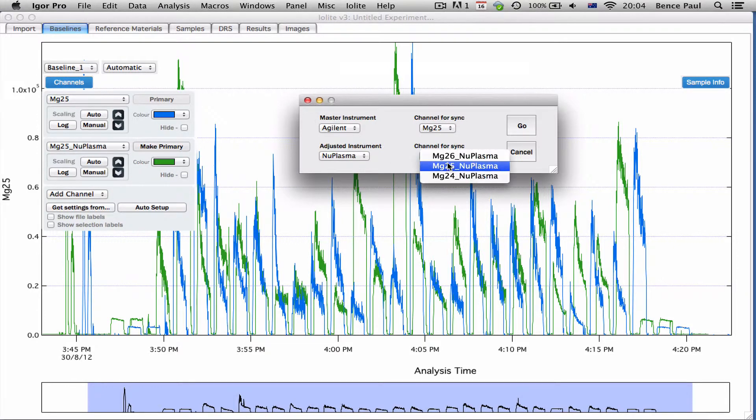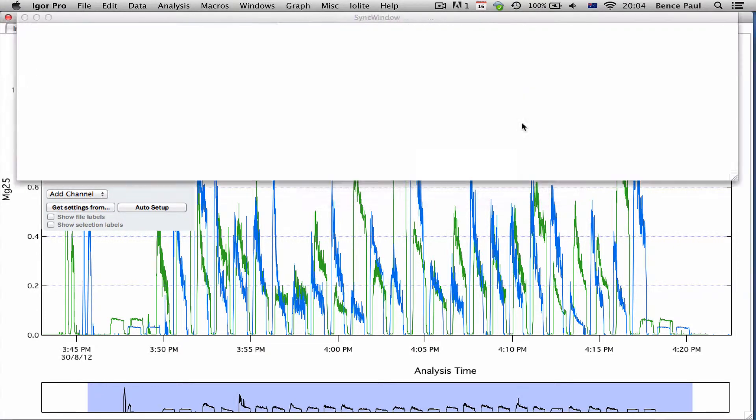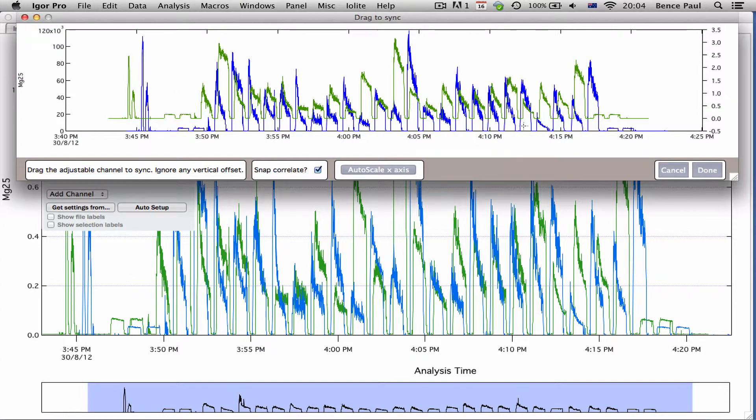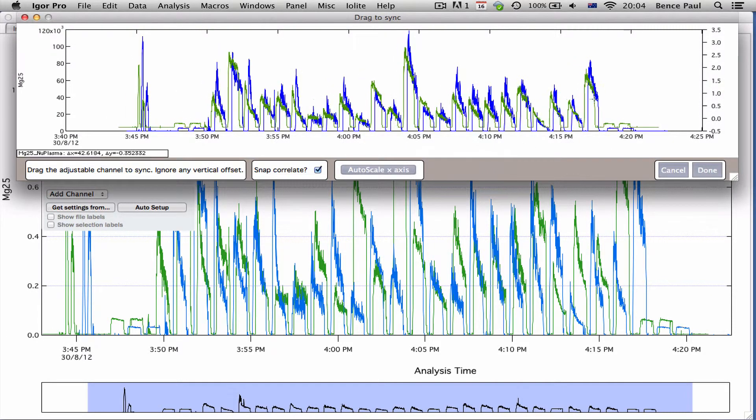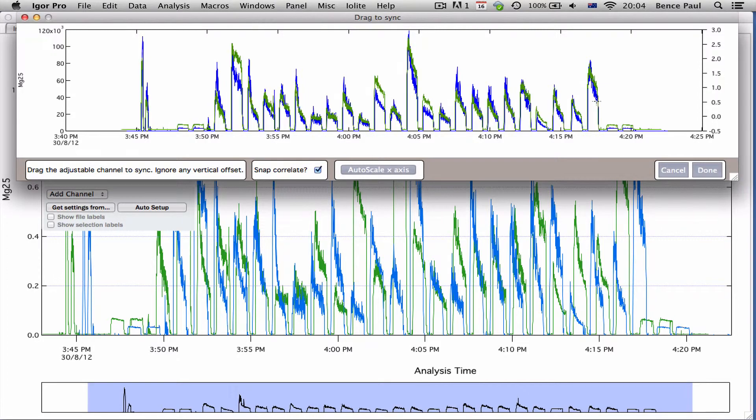So I'll just use magnesium 25 for both and you can see when it first comes up it has not correlated correctly, but we can just drag that now and it'll snap automatically to the best correlation.